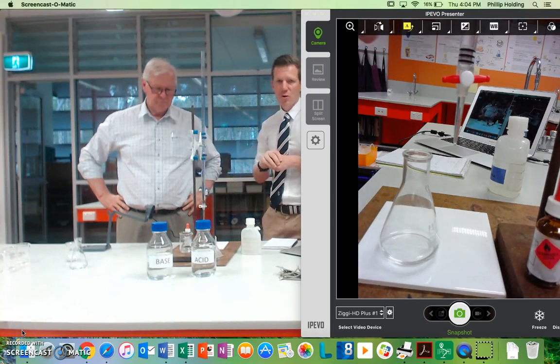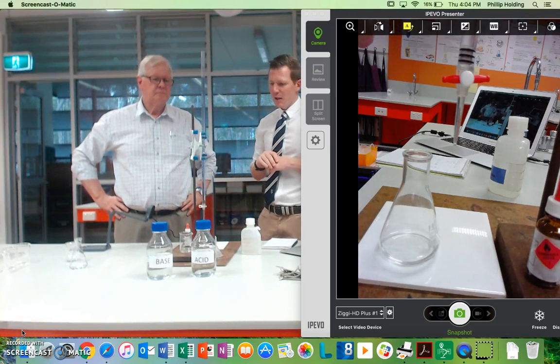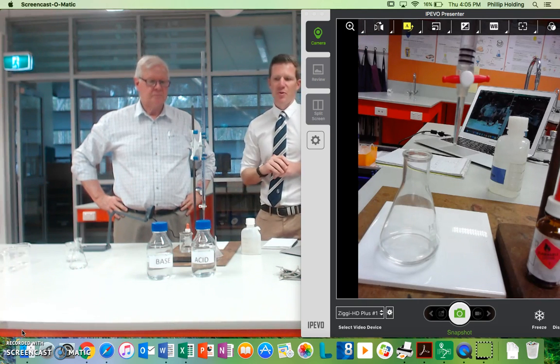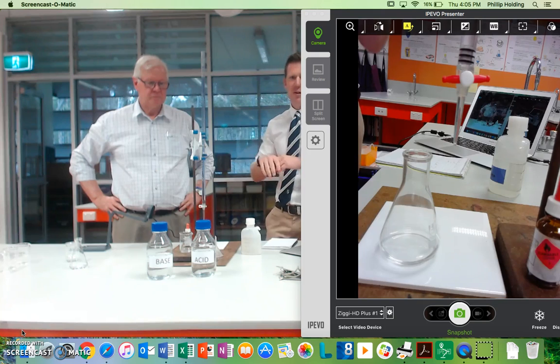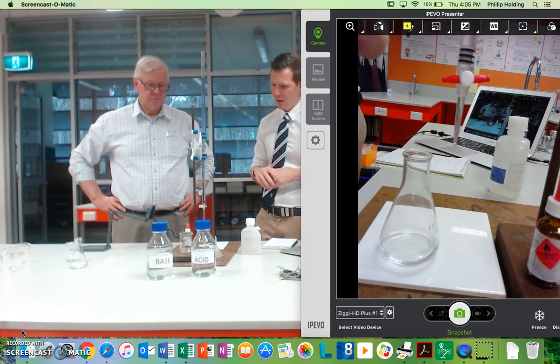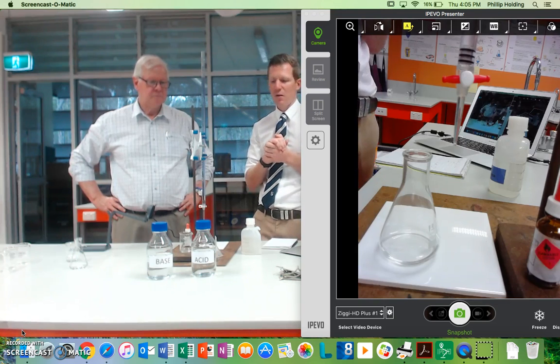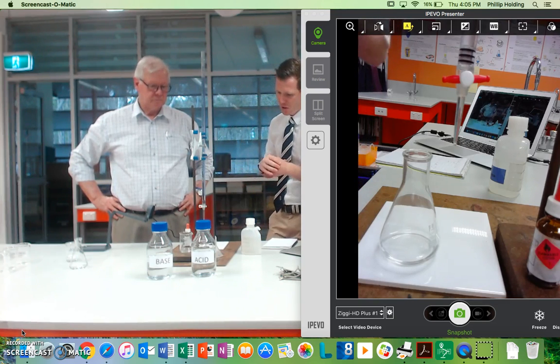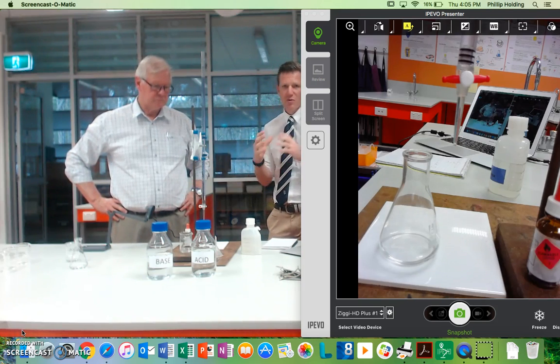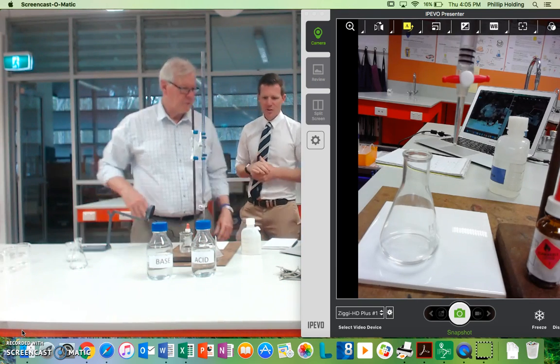Hi guys, Mr. Holding here, and again I'm joined by Mr. Jarrett. Today on this video we're going to go through the actual titration procedure. We've organized everything in the previous videos — we've got our base in here, our acid in there, everything washed and ready to go. So I'm going to hand over to Mr. Jarrett now to take us through the actual procedure and show us a few skills to make sure we do it accurately.